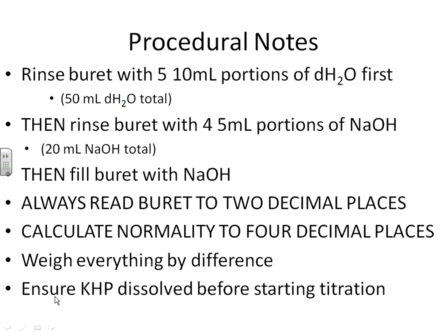Make sure that your KHP is completely dissolved in water before you start your titration. Any undissolved KHP at the bottom of the flask means that that's acid that isn't reacting, but that you think is reacting because you're working with that particular mass number. So you need to make sure that your KHP is completely dissolved before you start your titration.